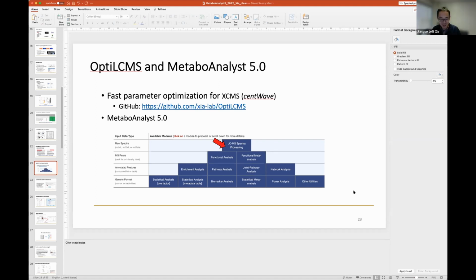Yeah, well, thanks for that question. So I think there's another tool called NOREVA, Normalization Quality. Because that one is designed for the quality checking. Oh, I forgot what was the full name of the web-based tools. For MetaboAnalyst, it's possible. I don't know. Because the next one is actually improving the annotation from peaks to compounds identification to be as good as possible.